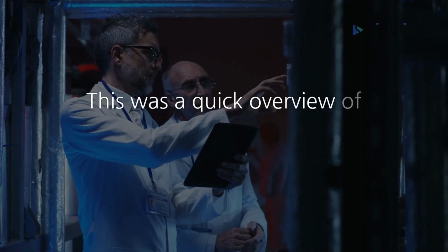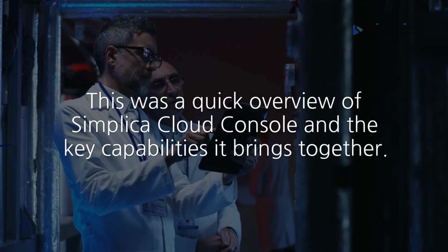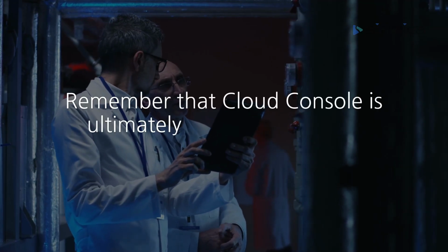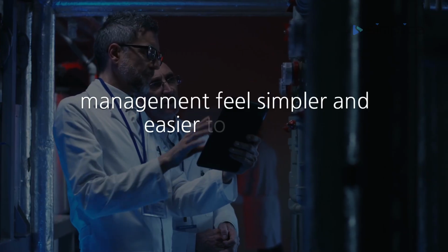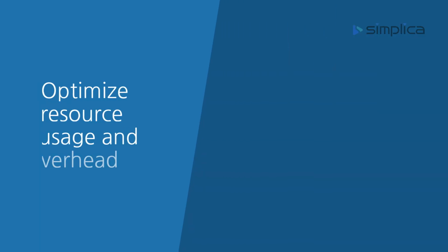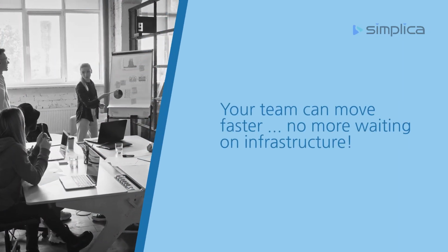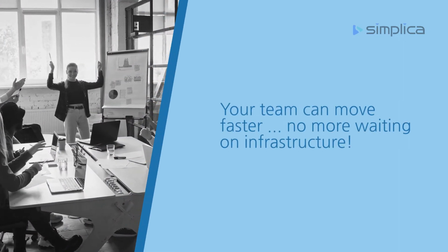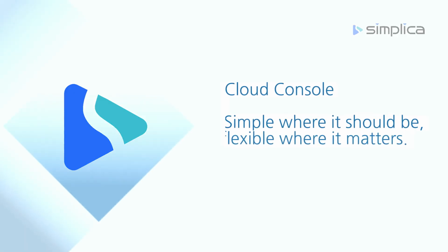This was a quick overview of Simplica Cloud Console and the key capabilities it brings together. Remember that Cloud Console is ultimately designed to make LabWare environment setup and management feel simpler and easier to control. The infrastructure model also helps reduce operational overhead while optimizing resource usage and overall costs. And with the environment setup reduced from weeks to roughly an hour, teams can move faster and spend less time waiting on infrastructure. Simple where it should be, flexible where it matters.